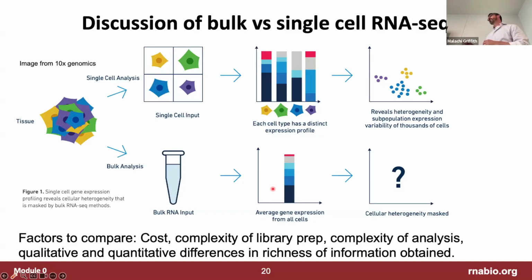So if you have that situation where you already know in advance, and this is often the case, that there's a mix of cells going on, then that's when single cell data becomes really important. If you're working in a system where maybe your transcript annotations are not that great, that might be a good situation where you do a 2-phase experiment, like you do some isolations of different cell types, you do really deep RNA sequencing on those, and you get transcript models.